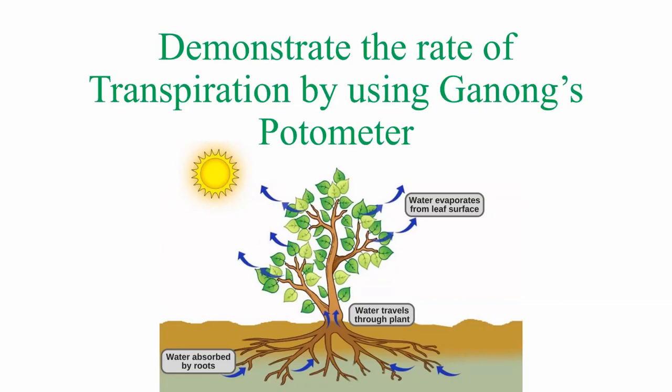So let's move on to our topic today: demonstrating the rate of transpiration using the Ganong's potometer. So what do you know about the Ganong's potometer, based on your school level knowledge? Did you know that before? No, madam.